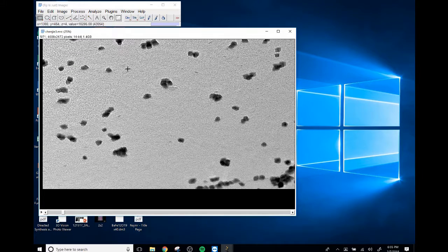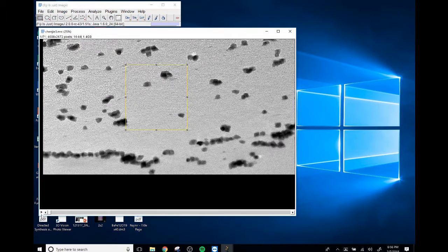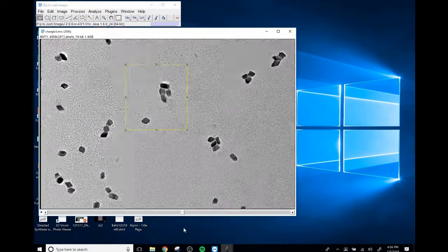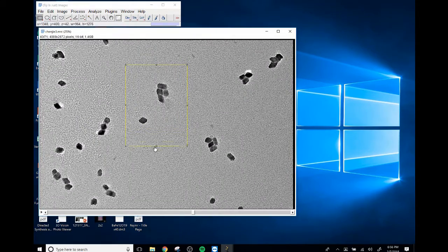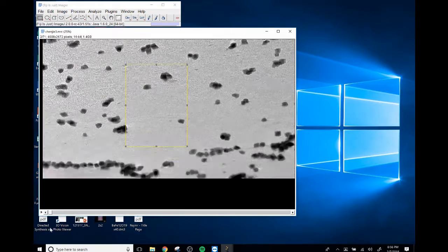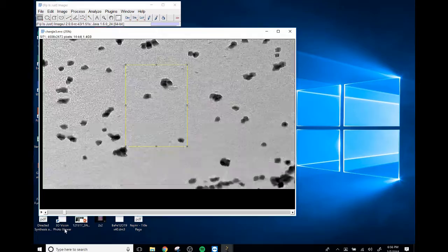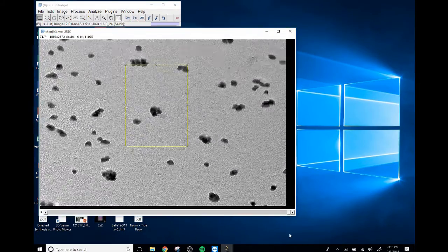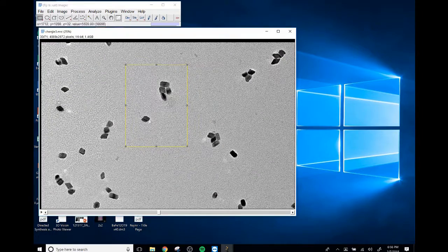So what we're going to do now is isolate on the particles that we are interested in, and we're going to try and use that big chunk up here as another way to triangulate the axis. We're going to want a little bit of extra background, so we can cut that out and rely on that being extra fudge space. And then we'll probably also want to do a little bit in this direction and this direction.